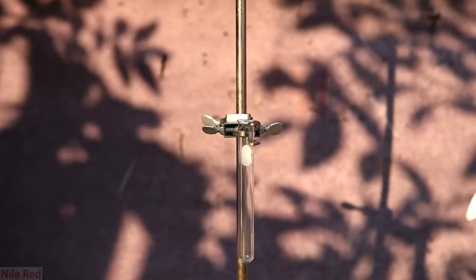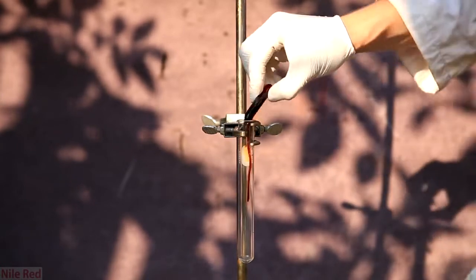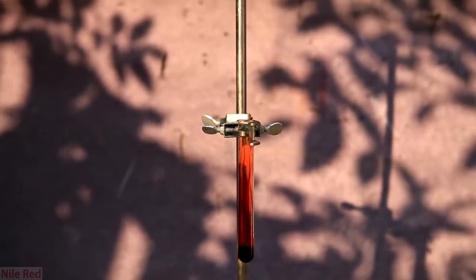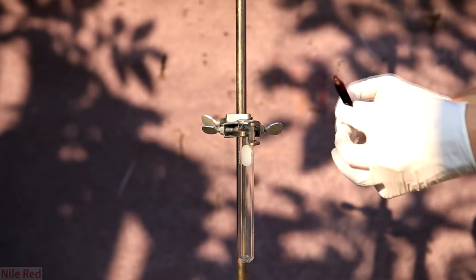I decided to do a second run. Also, when I crack the ampule, you might notice that I actually get some of the bromine spilled onto my glove. I kept this part of the video in as a reminder that things do go wrong. However, because I was prepared and wearing gloves, I simply took them off as soon as possible and everything was fine.